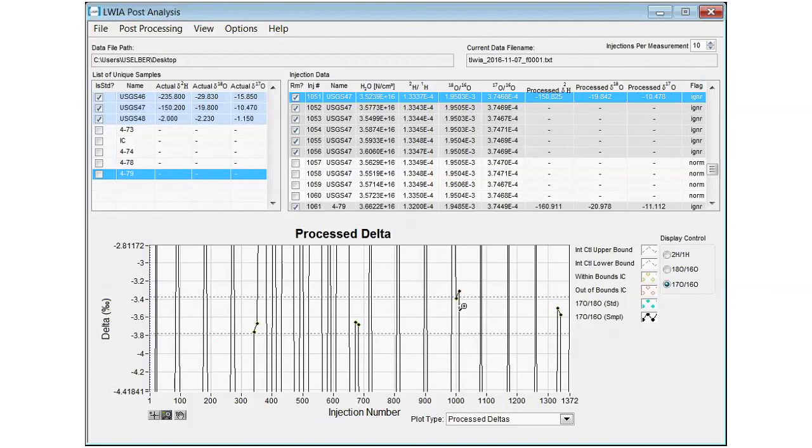But you can see from looking at the internal control, the block standardization and no injected volume correction, we had 3 of 8 in bounds. By the time we add the sophisticated calibration method, standardization, injected volume correction, you can see that that really brought our internal controls in to where we want those to be.